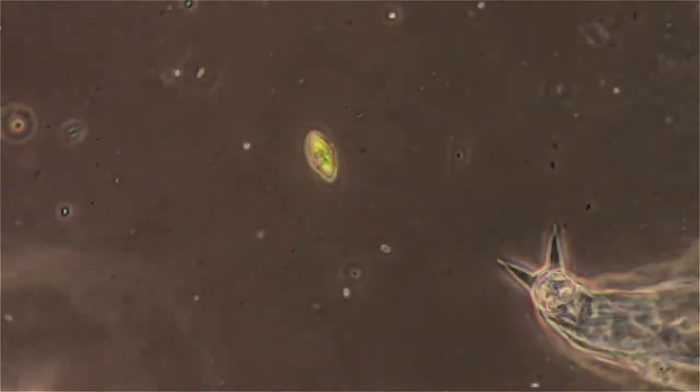Here's the foot of a rotifer right there. Algae.